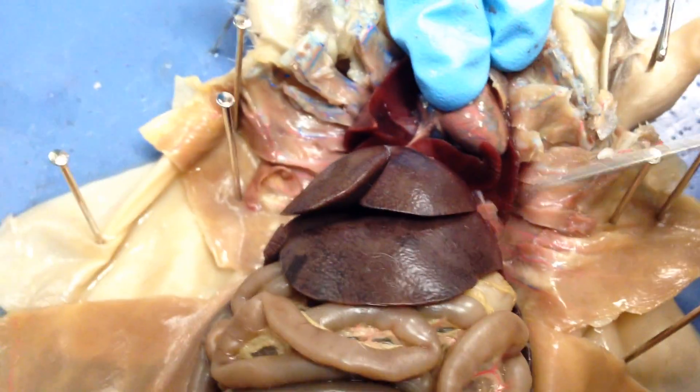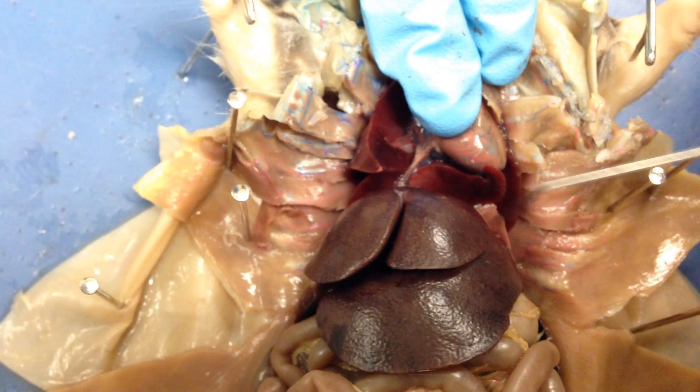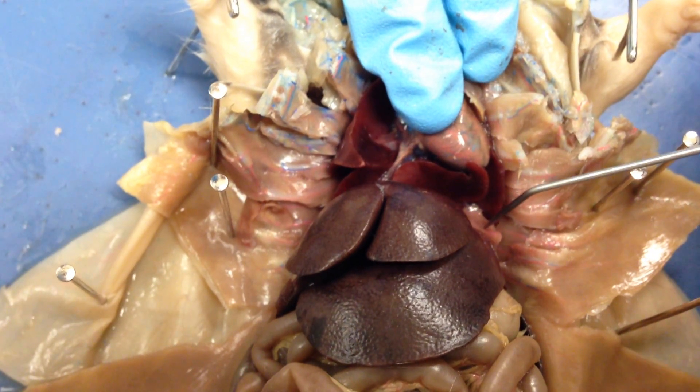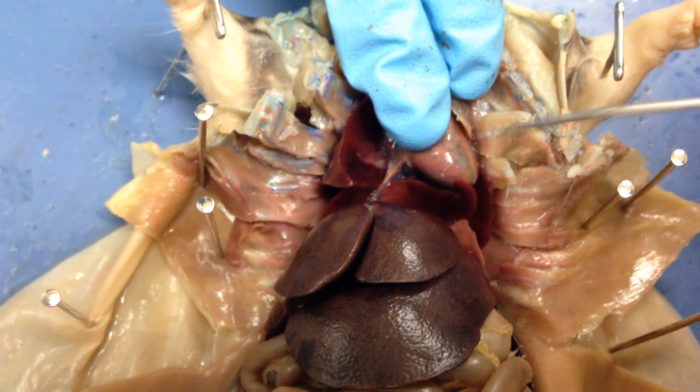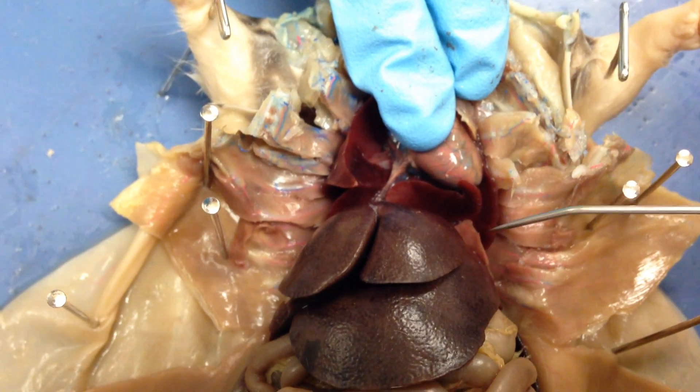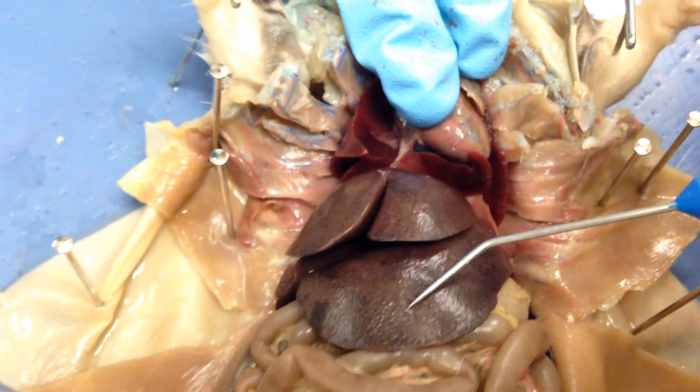This flap of skin from here to here — that would be where your diaphragm is. The diaphragm was originally attached to the body wall, because when your diaphragm expands it needs to be attached to the body wall. Here we have our liver lobes — one, two, and three.